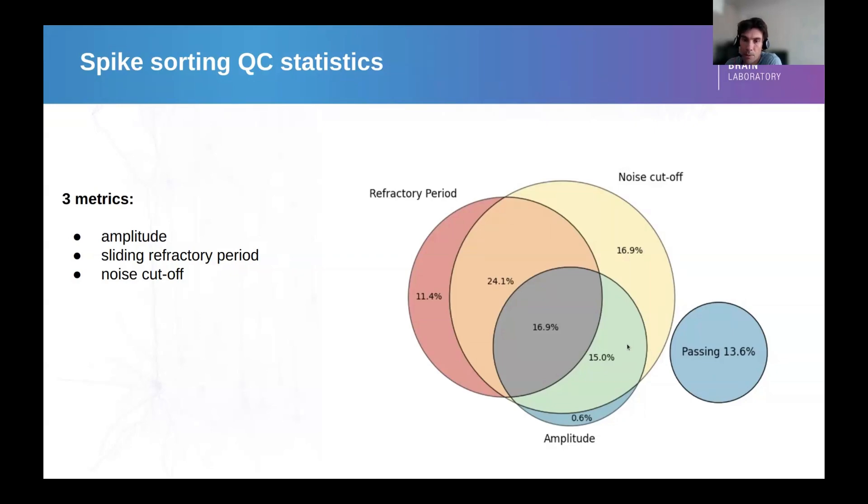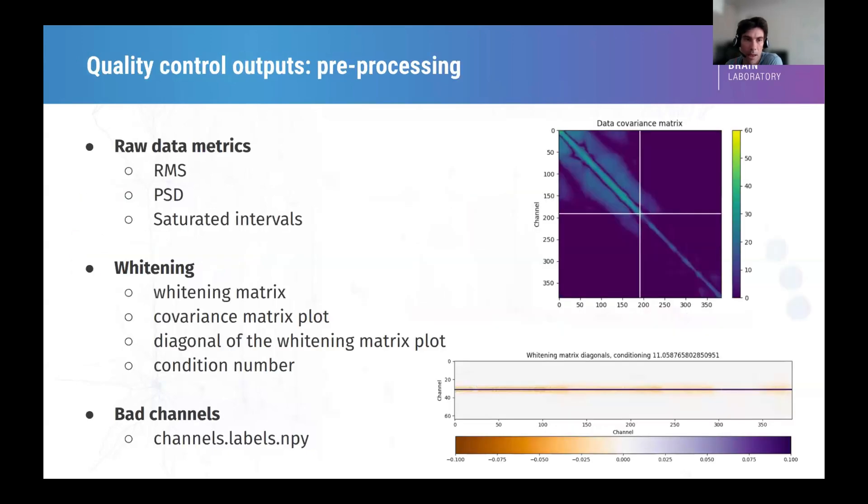Next, I'm going to go over what are the outputs of the spike sorter now, and especially the quality control outputs. This will be part of the assignments. We output some figures, some raw data metrics that I've shown before. But we also output some figures about the covariance matrix. We output the covariance matrix heatmap, and we output a heatmap of the diagonal parts of the whitening matrix. This allows us to see if there is an issue, especially with the condition number. If this is higher than 50, we probably have issues, and this is something to be looked at. This is a dataset to be looked at.